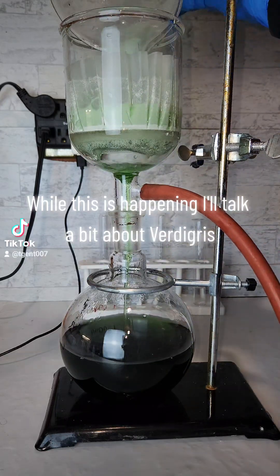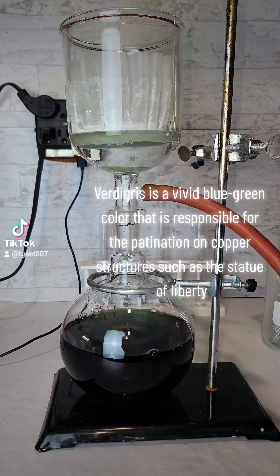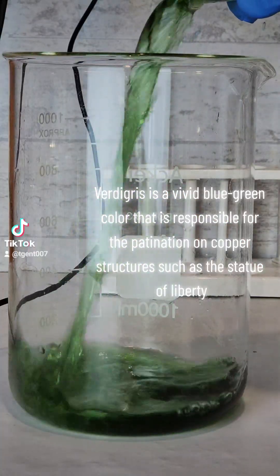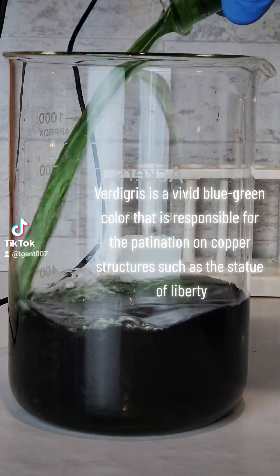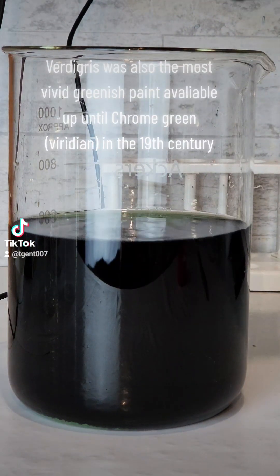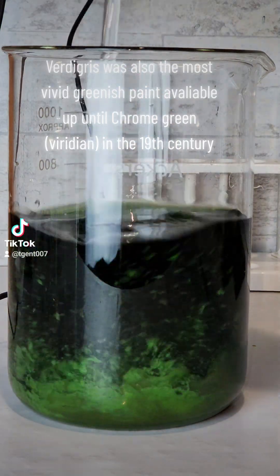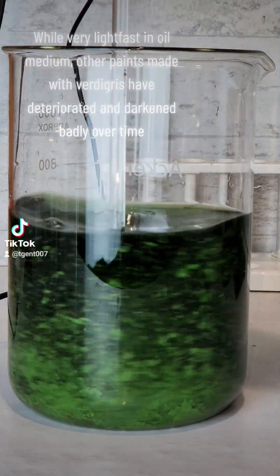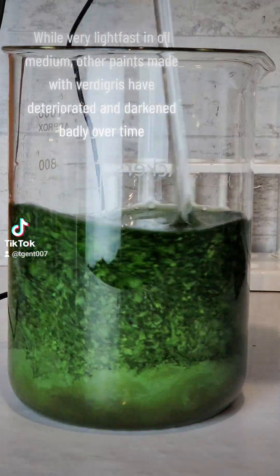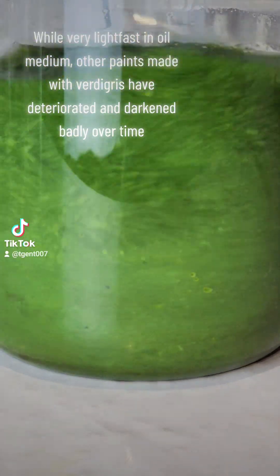While this is happening, I'll talk a bit about verdigris. Verdigris is a vivid blue-green color that is responsible for the patination on copper structures such as the Statue of Liberty. Verdigris was also the most vivid greenish paint available up until chrome green viridian in the 19th century. While very lightfast in oil medium, other paints made with verdigris have deteriorated and darkened badly over time.